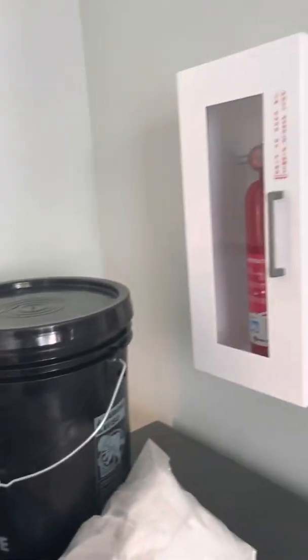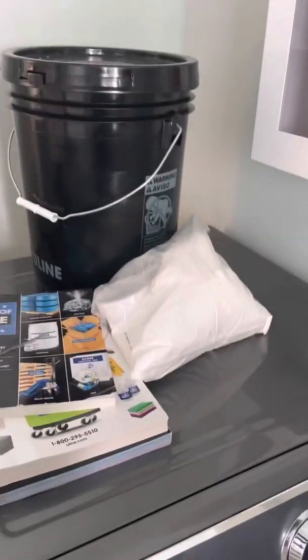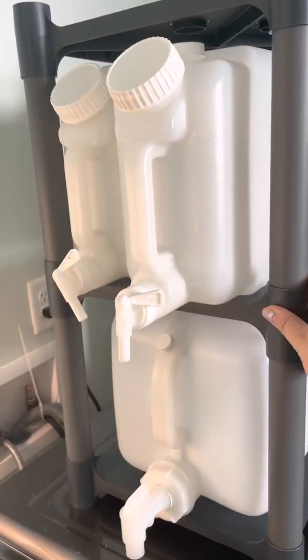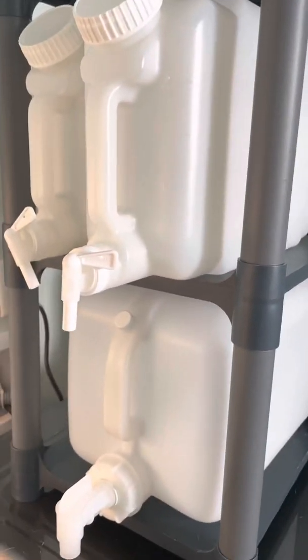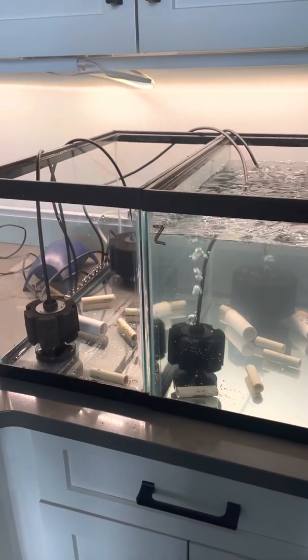So we'll start with the lab. Here's the fire extinguisher — very cool. Some salt and magazines, and some sterile carboys for when I start doing algae cultures that are super sterile. I don't want bacteria or other algae cultures contaminating them, so that's where the water is going to be stored. And this is a trash bin.